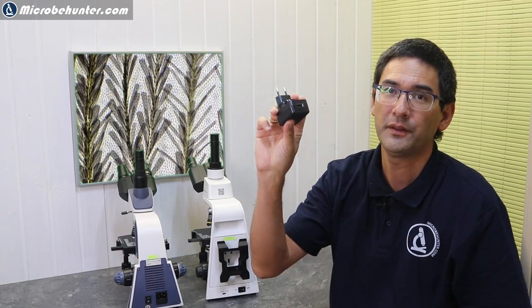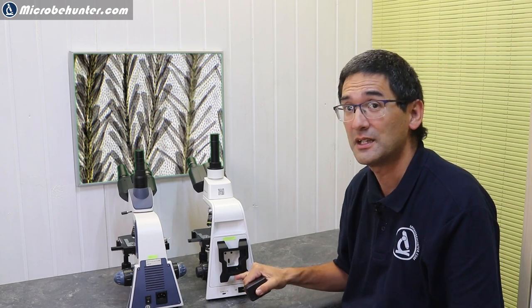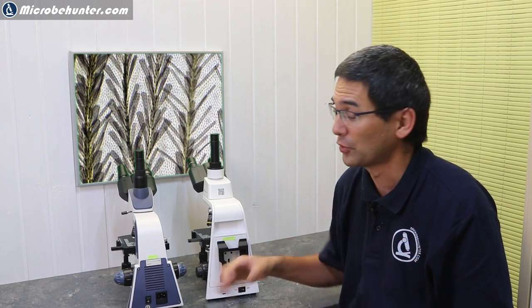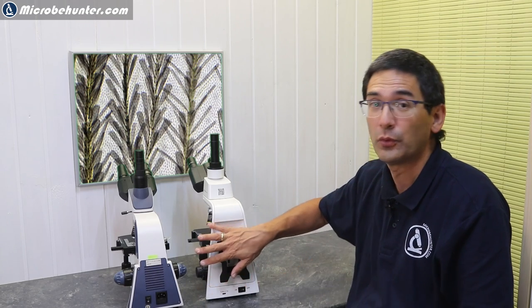The Stellar One is actually powered with a USB adapter. It's the first time that I'm actually seeing something like this. It does give it the advantage that you can also connect a battery power pack. However, this is something unique I have not seen before. Personally, the way that I use the microscopes, I always leave them on a table and they're always connected to a power supply anyway. But if you need portability or if you are in a classroom which does not have a power supply on every desk, then you might consider also the one with the USB-C power supply.